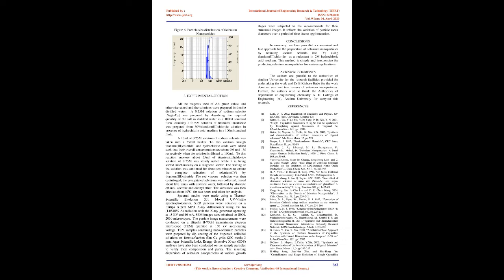SAED pattern of TEM images. The SAED images obtained from TEM studies clearly indicate that selenium nanoparticles are crystalline in nature. This is because the decrease in the viscosity of the medium, 2 M HCl, allows the dissolution of amorphous selenium particles in the solution to be deposited on the few trigonal selenium seeds which are expected to be formed in the reaction medium. The EDX spectrum of the pure selenium nanoparticles is shown in Figure 5 and shows the peaks of pure selenium. Particle size distribution.